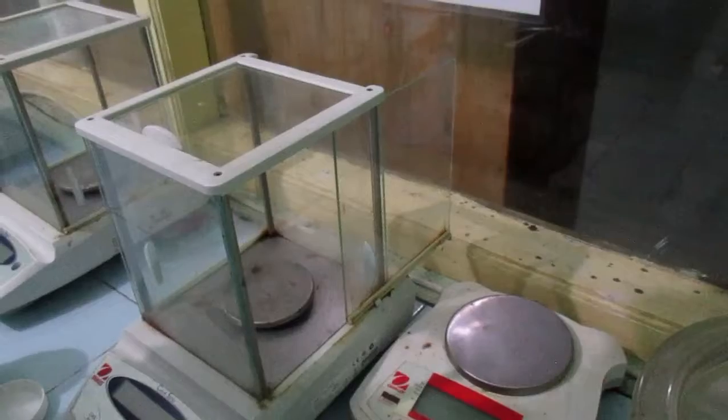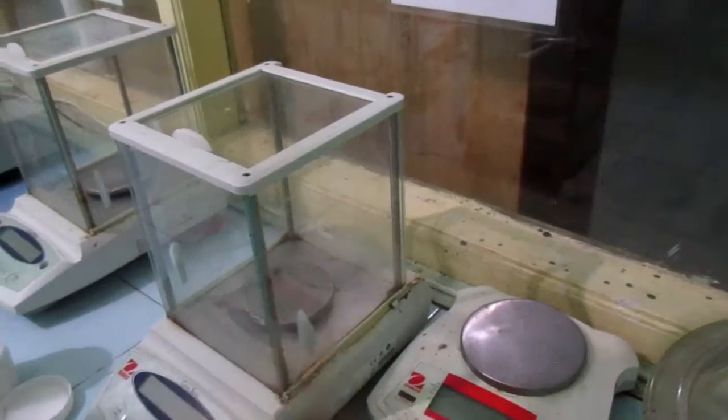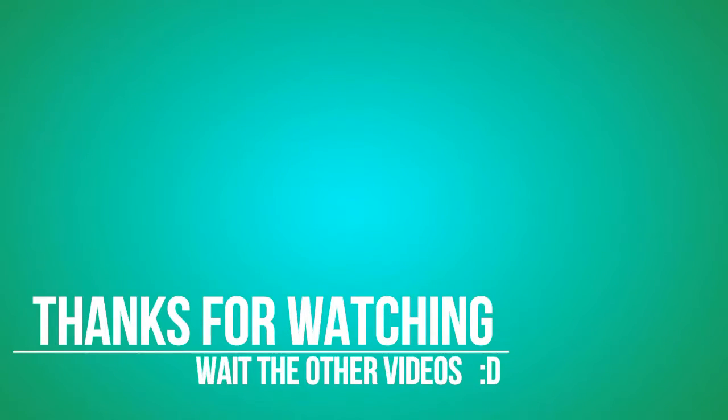After use, clean the analytical balance again using the brush. This is our result — I hope this is useful for you all. Wassalamualaikum warahmatullahi wabarakatuh.